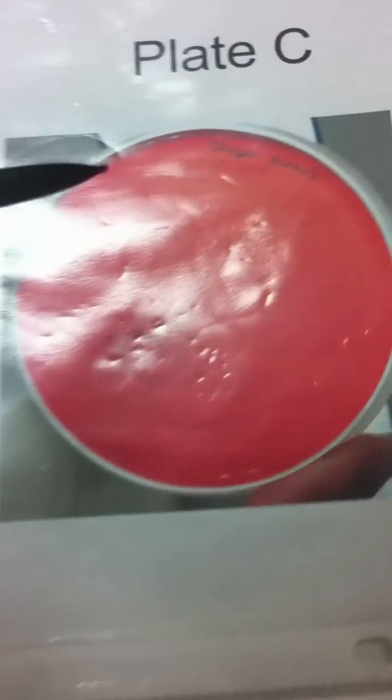It does not break down iron, so you'll see a greenish color around the colonies. Gamma hemolysins break down the plasma proteins only, so the red blood cell is still present. You'll see red around the colonies.